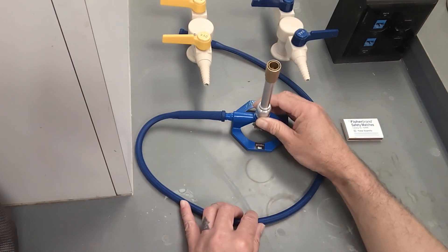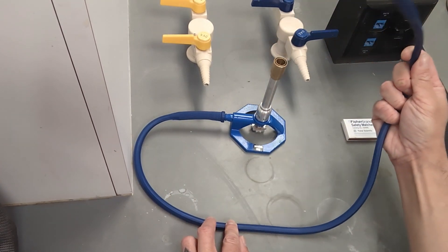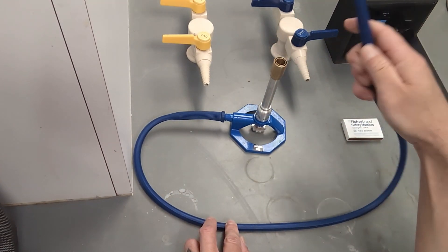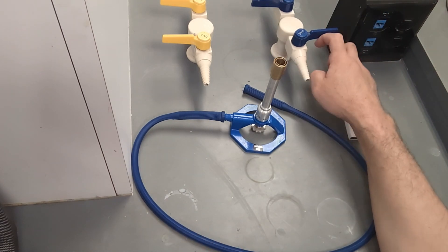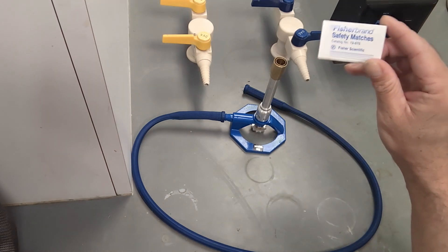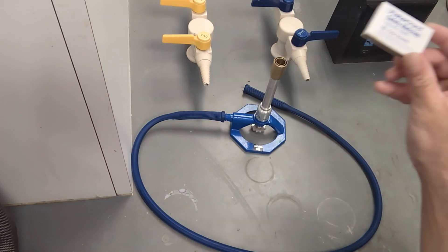The Bunsen burner is going to have a gas hose attached to it in order to have a supply of gas from a gas line. The gas line will have an open and close valve and you will also need some matches to use for your Bunsen burner.